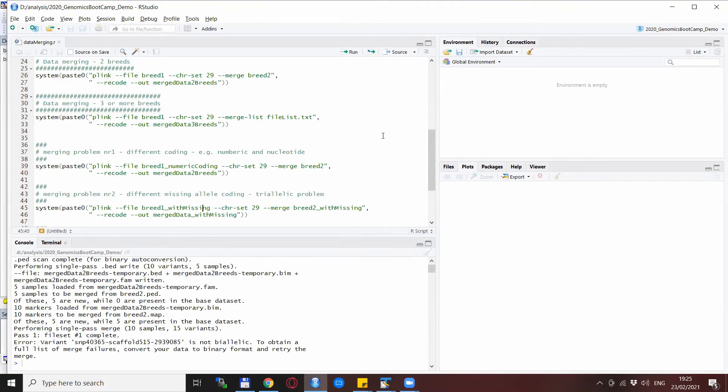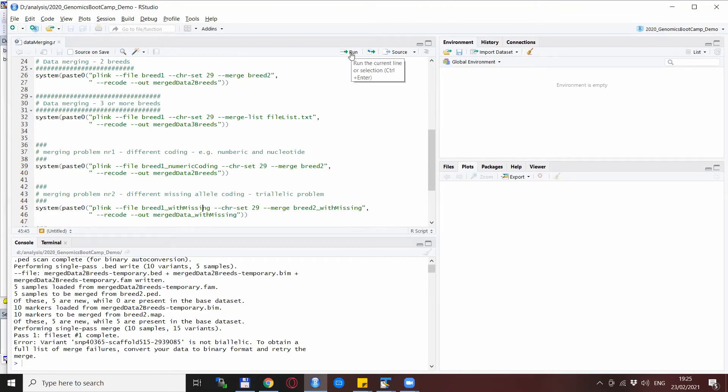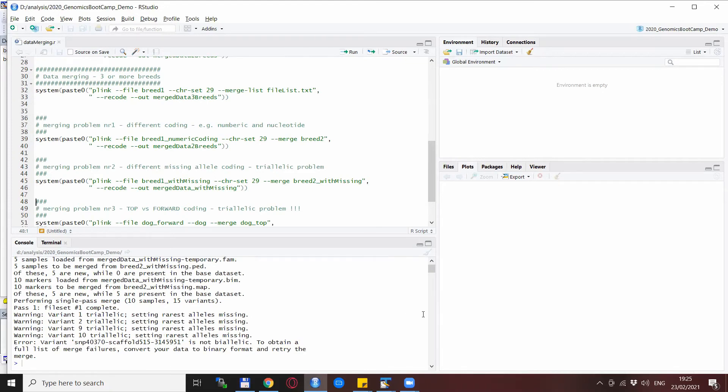So back here in R just to show you what happens. You see that it comes up with a bunch of warning messages and then also an error message that again a SNP is not bi-allelic and with a lot of warnings that there are some tri-allelic SNPs present in your dataset. This is generally a problem so you need to address this and find out why is this happening, and then of course correct it and then run the merging again.